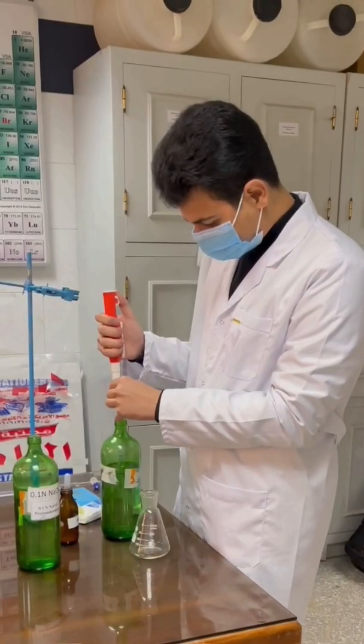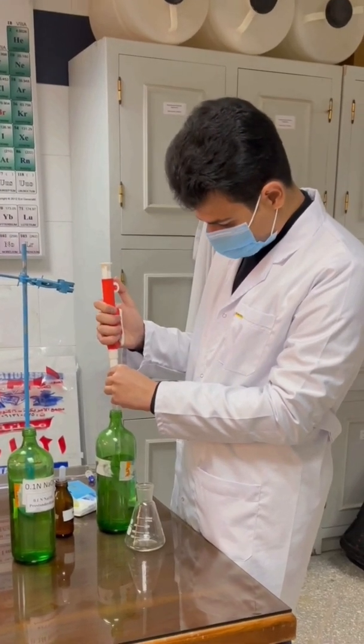Then we are going to transfer 10 ml of the sample HCl into a conical flask.